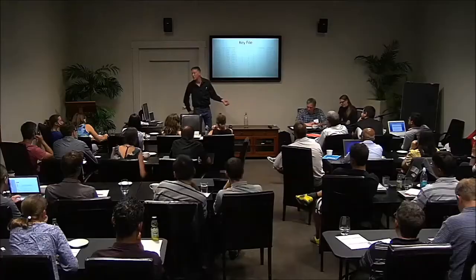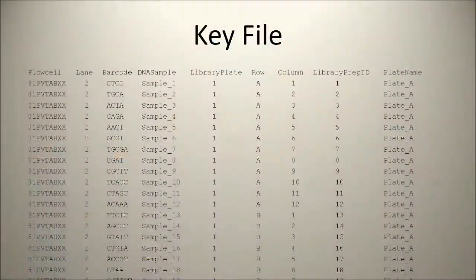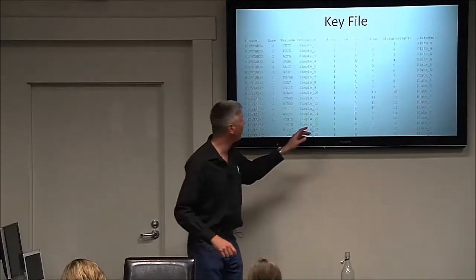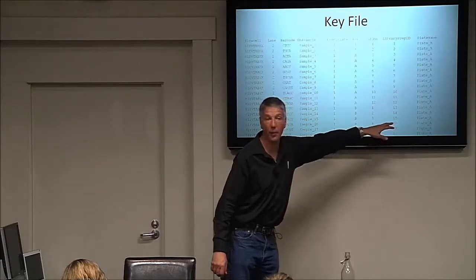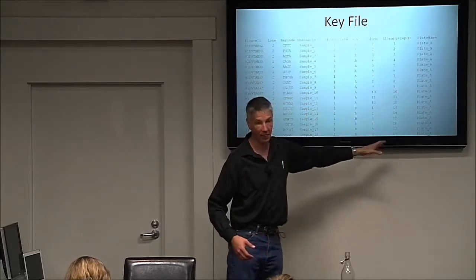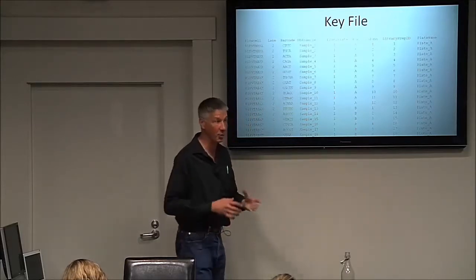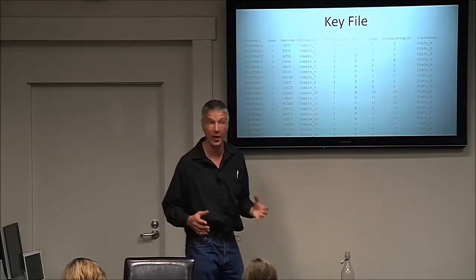There are ways to do this in the pipeline. Yeah, so there are tools available to do this merging of things, and it can be done at the level of sample name, but there's also this column of library prep ID. You know how we said before that sometimes you'll take a library and run it multiple times, right? If it's coming from the same tube, the same library, and it's the same sample, it will always have the same library prep ID. At Cornell, we developed a system that, as it goes through the process, generates that unique identifier and keeps it in a database. And this is something as a community, as we start building up our own infrastructure, we'll have to sort out how best to do that together.